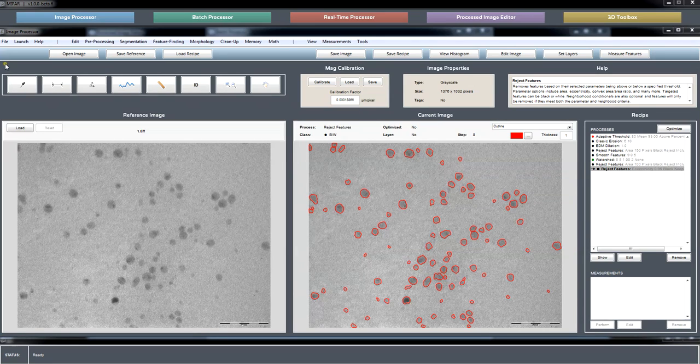The 5th place was particle or grain size analysis, proposed by Jeff Fenton and voted on by several folks. And I know I get a lot of grain images and particle images that I want to cover. So let me show a grain image that Meg was kind enough to provide, and show the quick recipe for segmenting that, and hopefully deal with her scale bar on the bottom.